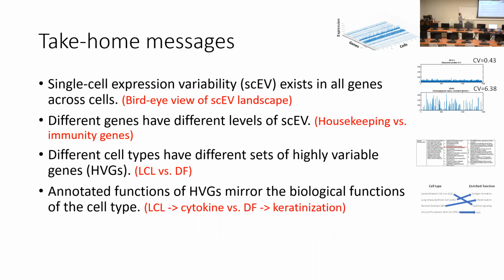So these highly variable genes are important. When you compare the mean across different samples, before treatment and after, the gene set you get will be completely biased if you don't consider the variability change at all. Yeah, believe me, the DE analysis will drive you in the wrong direction. I have to tell this to all my collaborators from biology labs. I have to write a comment paper to discuss this further.